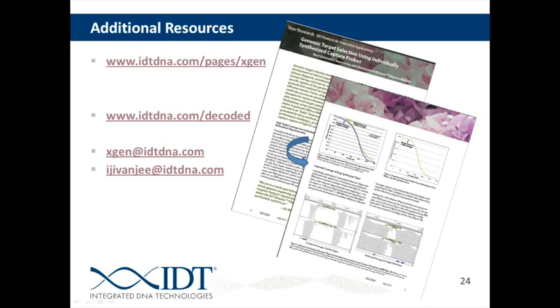Sure, sure. The only other thing I'd add is that, depending on the sample volume, if you have hundreds or thousands of samples, you could definitely benefit from going with the lockdown probe approach. Okay. I'm going to throw this out to Ibrahim first, but I think, Adam, you could probably add something to this as well. So how many targets can you do per reaction, and then how do you process the samples?